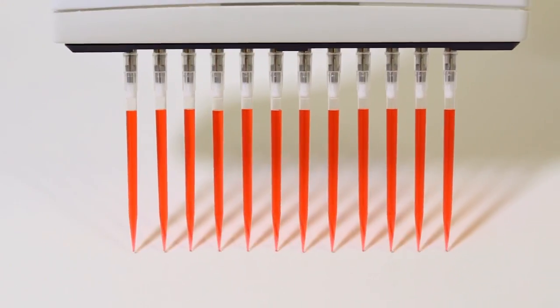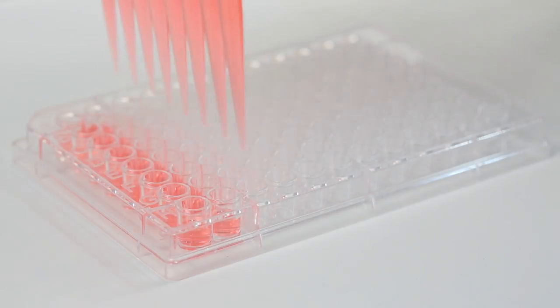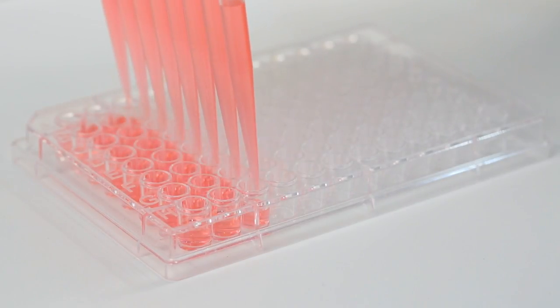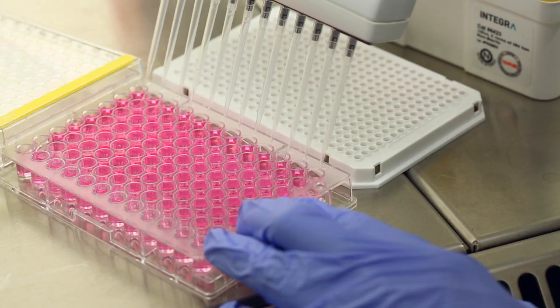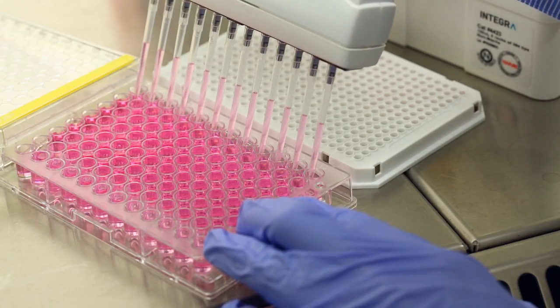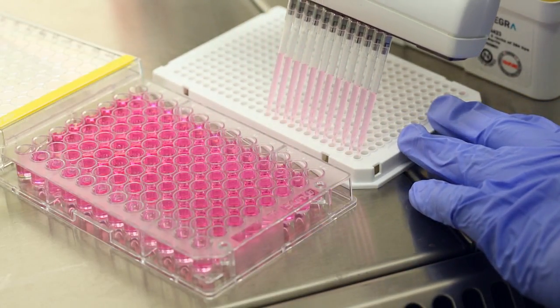This guarantees that all tips are at an identical height and remain firmly attached, regardless of how many side wall touch-offs are performed. Enabling multiple transfers significantly reduces the number of pipetting steps, which greatly benefits the overall ergonomics of pipetting.